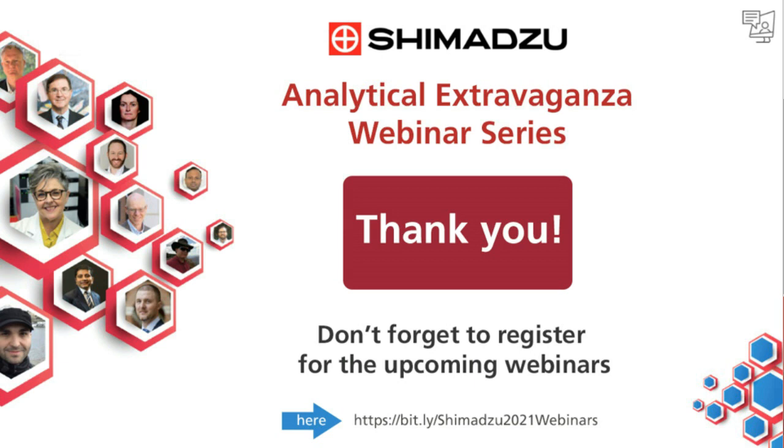Okay. Thank you. Next question is, which bioenzyme is used for L-carvone from D-limonene? Enzyme? I don't know about the enzyme. I had done acidic hydrolysis to convert limonene to carvone. If you use D-limonene, you'll get L-carvone. It's like a stereoselective synthesis. And if you use L-limonene, you'll get D-carvone. I did that, and it was exclusively only one isomer. I don't know about enzyme science.